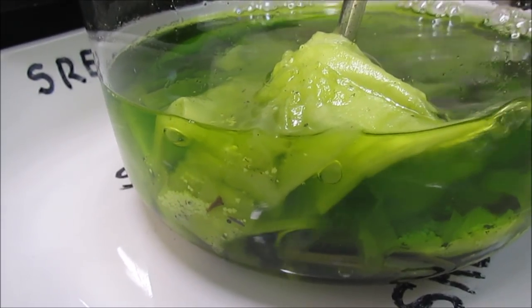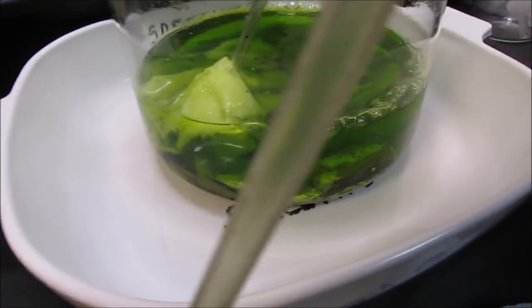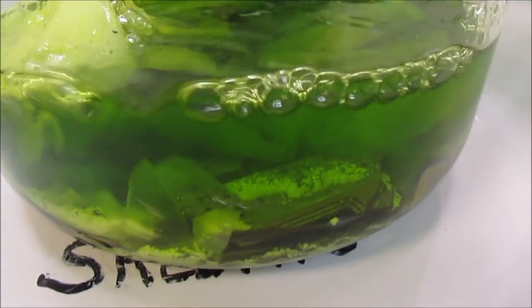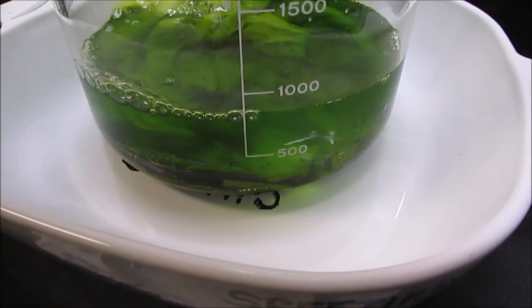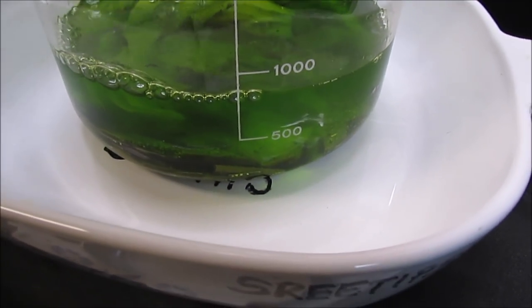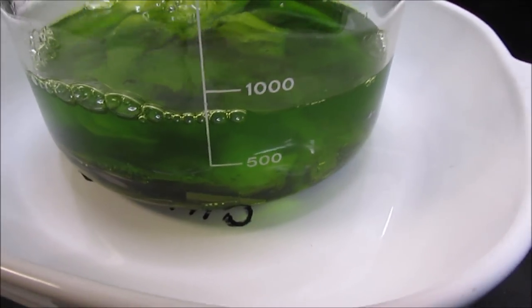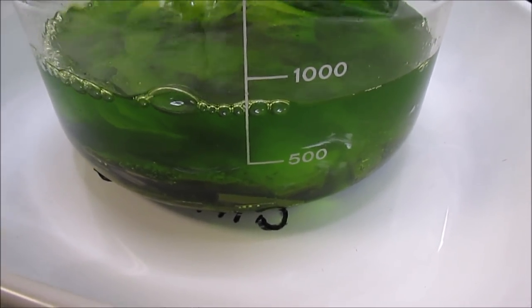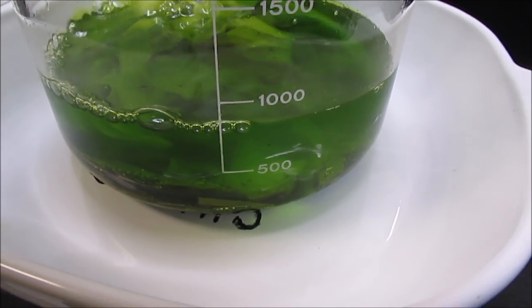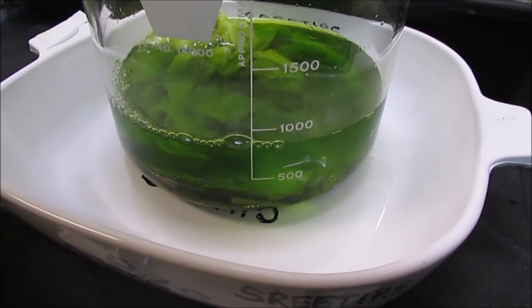So we've been on the bubbler here with sodium chlorate and hydrochloric acid for about 2.5 hours now. Just wanted to point out here, earlier I said I put 1.5 liters of hydrochloric in, and apparently I misjudged greatly because I was only like 900 in the beaker, so I've only got 900 ml of hydrochloric in there, not 1.5 liters as stated earlier in the video.